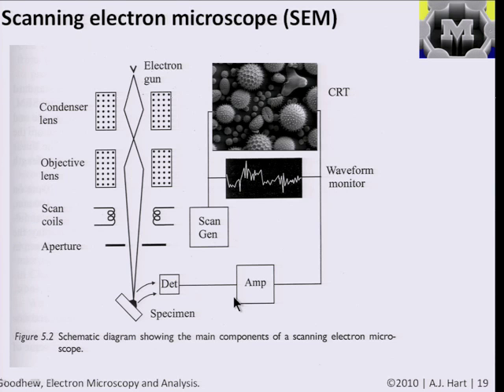So sort of the next step down in the length scale of looking at materials is to use an electron microscope. And still the STORM technique and the other advanced optical techniques don't have the resolution of an electron microscope because an electron microscope can go down to, you could say, the nanometer length scale, dictated in the same way as optical microscopy by the wavelength of the beam, but the wavelength of electrons and X-rays, as we see later, is much, much smaller than light. So therefore, you can resolve smaller features.